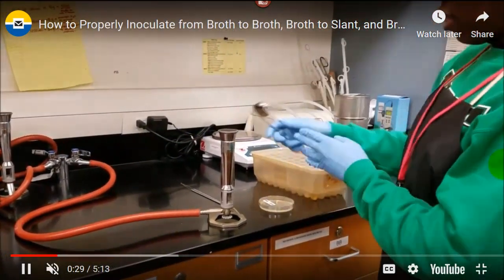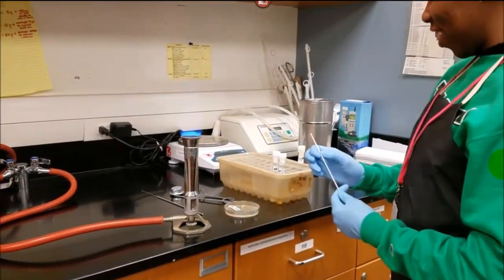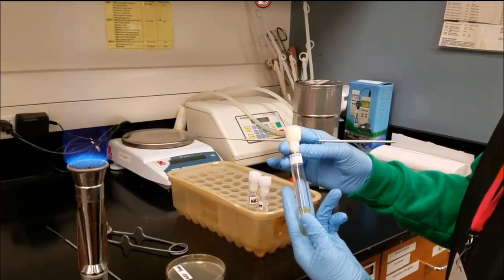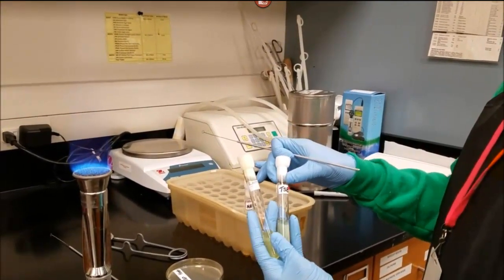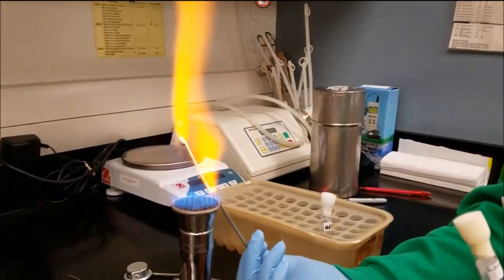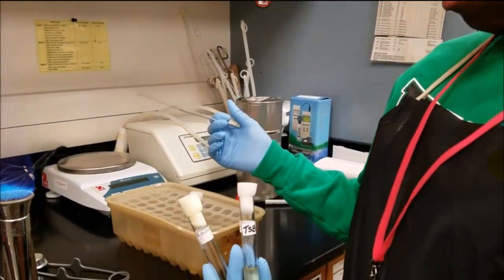Okay, now we're going to light a Bunsen burner, and all these videos, they're using a little strike plate thing, which I'm starting to get jealous. Here's the inoculating loop, and there is a broth culture. Now the difference between a culture and, well, there's a sterile broth, and then a culture has a microbe growing in it. So it looks like, here she goes. She's going to sterilize her loop, and she just flamed the whole thing. Good deal. And man, that's a serious Bunsen burner she's got.